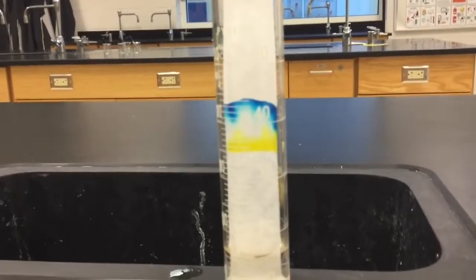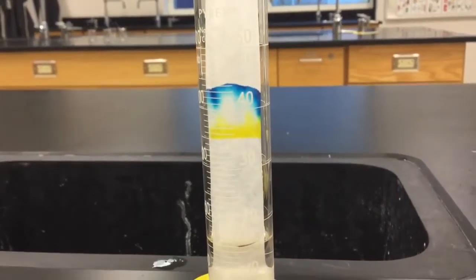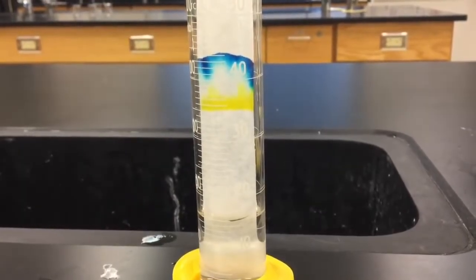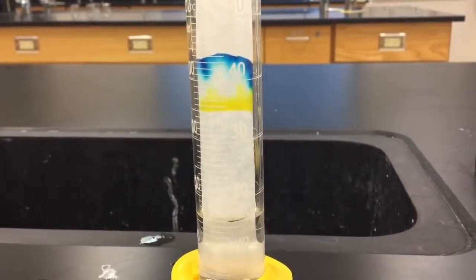Here is another look at your chromatography paper. It has been about 10 minutes, and now the green is completely gone and the yellow and the blue have separated.